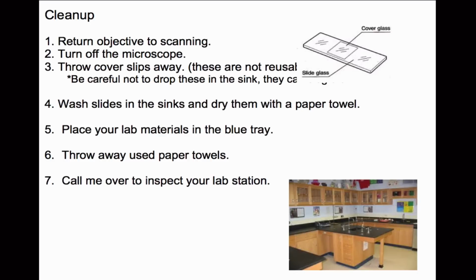So you're going to wash the slides in the sink and then dry them with a paper towel. Make sure you dry them off because if you don't, it'll leave spots on the slide and then you can't really tell those spots from what you're looking for. You're going to place the lab materials in the blue tray that is at your lab bench. Throw away any used paper towels, and then you can call me over and I will inspect your lab station.